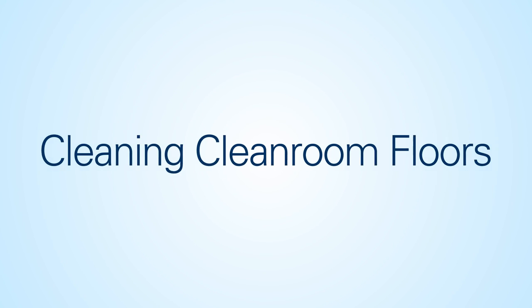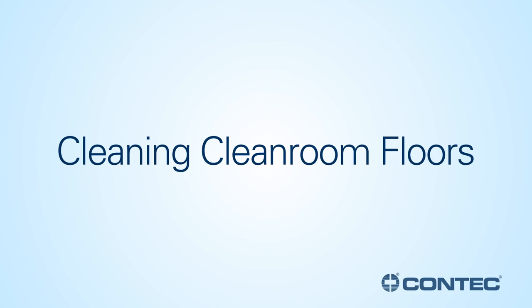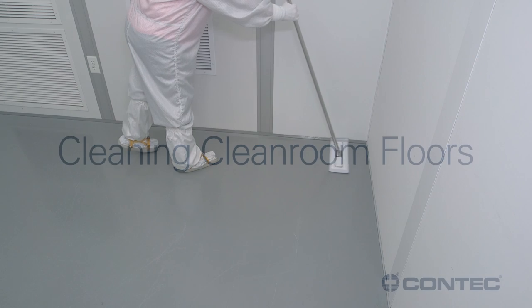In this video, we will demonstrate cleaning and disinfecting cleanroom floors. Always follow your facility's protocol.